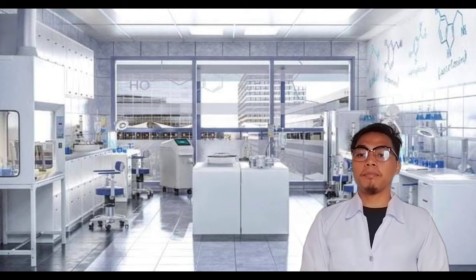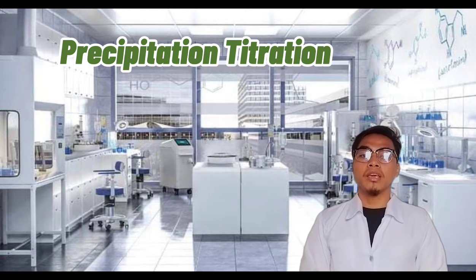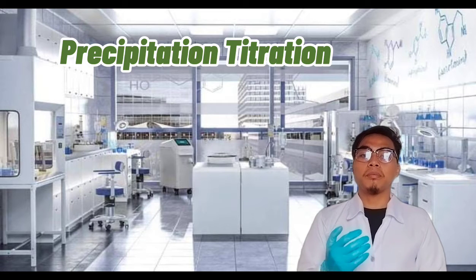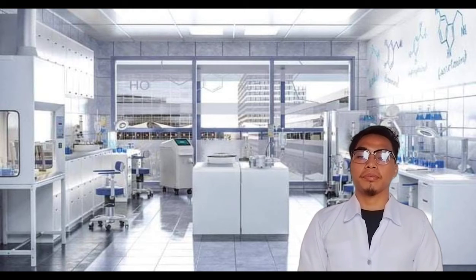Fourth one, we have precipitation titration. This type of titration involves a reaction between the given analyte and the titrant, wherein an insoluble precipitate is formed. The endpoint of this titration is noted when the addition of the titrant no longer forms a precipitate.